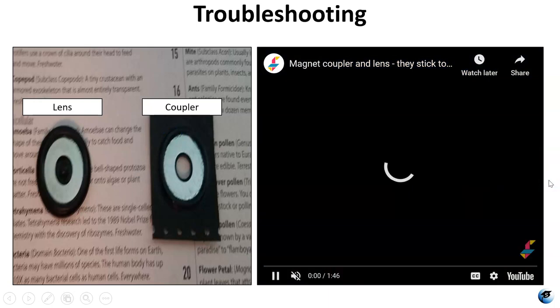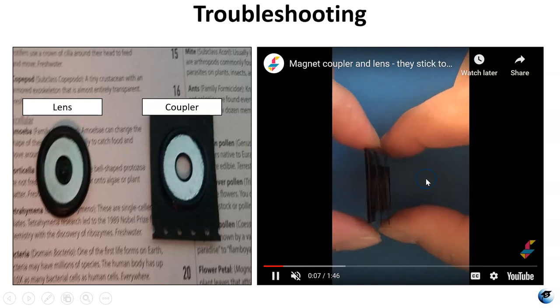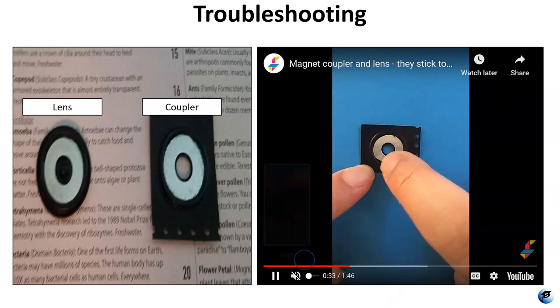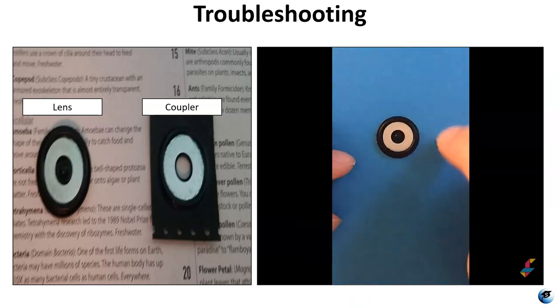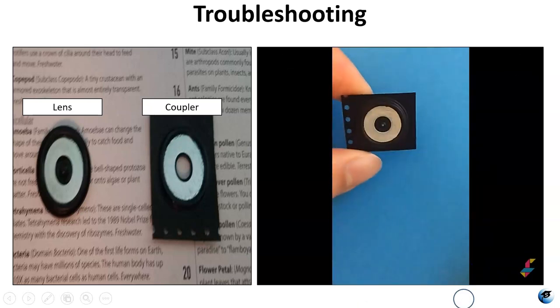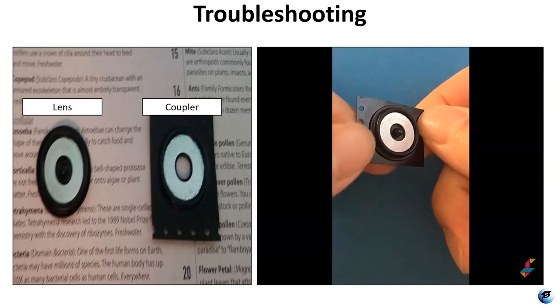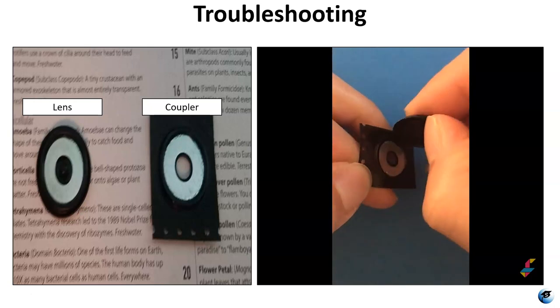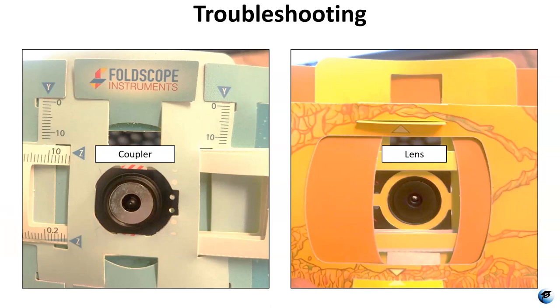This video shows what that looks like and how to separate them. It looks like one, two, three pieces but it's actually four. This is what a coupler looks like by itself, and this is what the lens looks like by itself. In my kit those two pieces were stuck together, and all you have to do is bend down one corner of the coupler and then lift the lens off. Once assembled, the coupler is on the blue side, and on the underside you put a ring sticker and attach the lens.